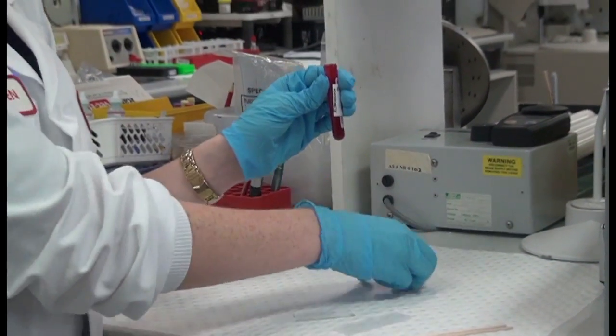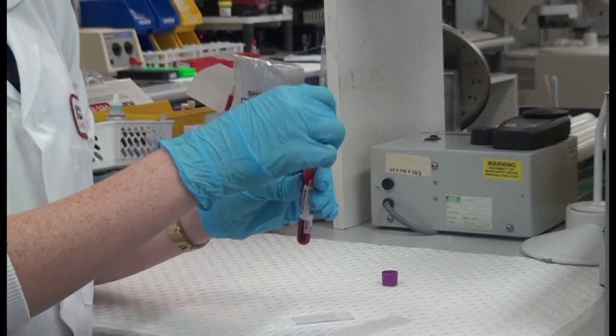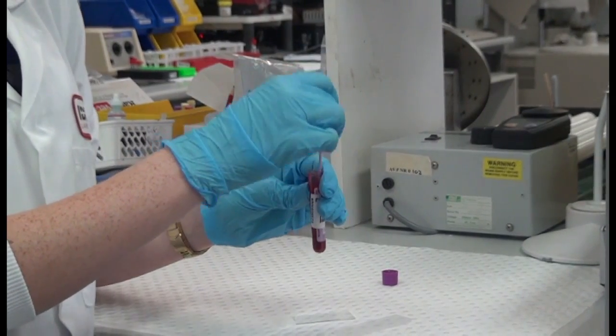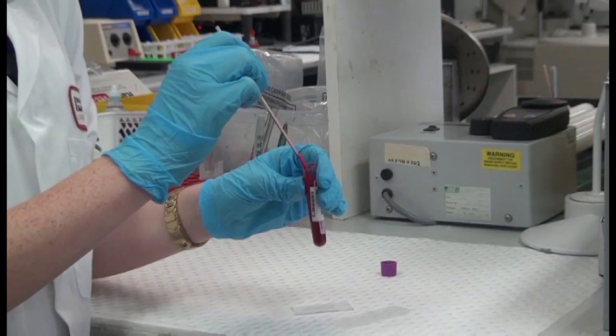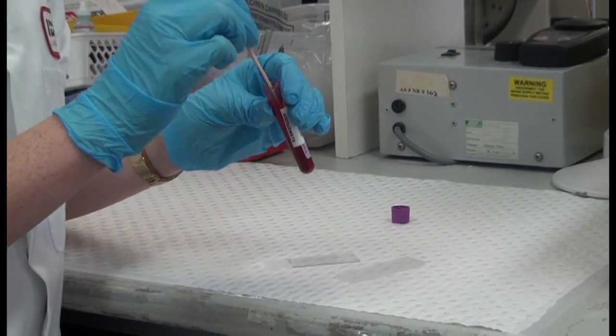Open the tube and insert your applicator sticks. Give it a nice mix to check for any clots. Pull the sticks out — there are no clots, as clots will stick to the sticks.